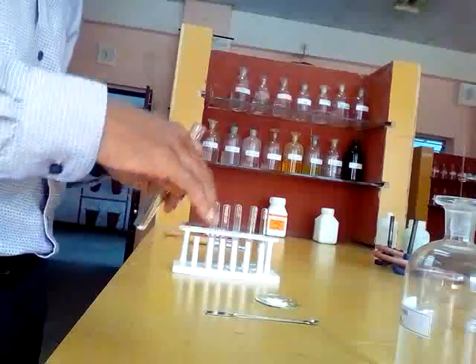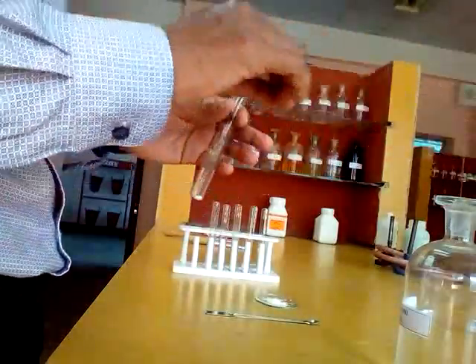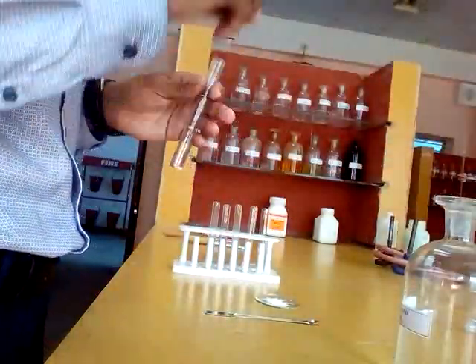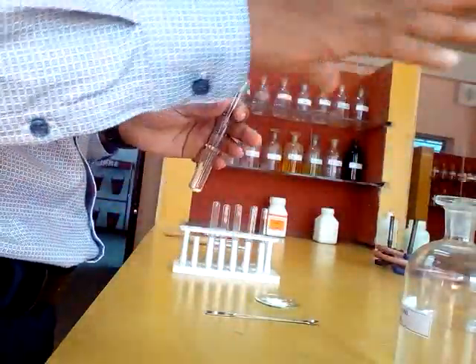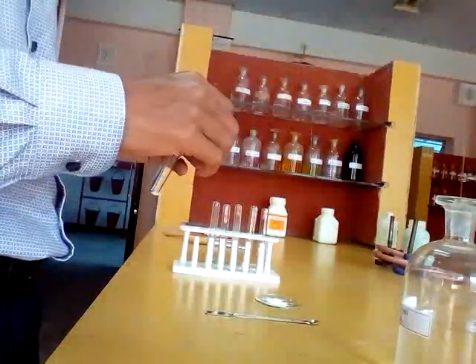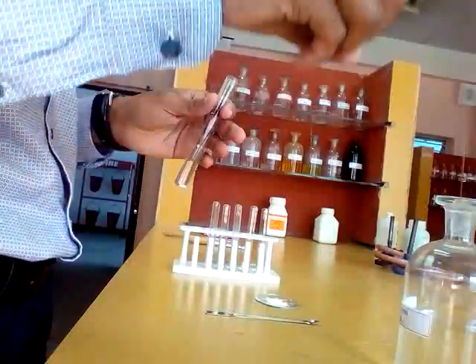If you get a rotten egg smell, then it indicates sulfide radical. If you get suffocating gas, then it indicates sulfite radical. If you get brown fumes after adding dilute sulfuric acid, then it indicates nitrite radical.